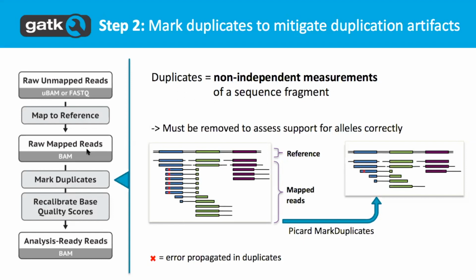We're kind of paranoid about that, partly because we process very large data sets. For example, the gnomAD call set at this point is over 100,000 whole genomes. It costs a ton of money if we have to reprocess all of them. For a cohort like that, you have to have them all aligned in exactly the same way. So if we change the aligner, we have to reprocess all of the data, and we often reprocess a lot of the other data sets sequenced at the Broad for internal groups as well as some of our customers.